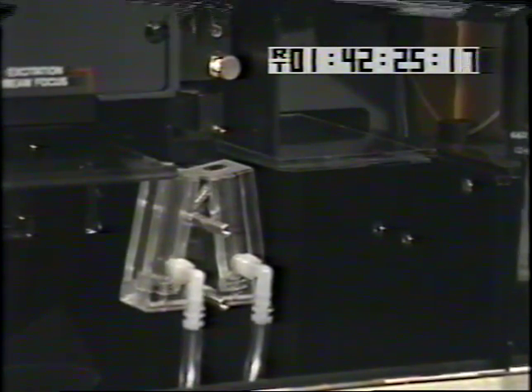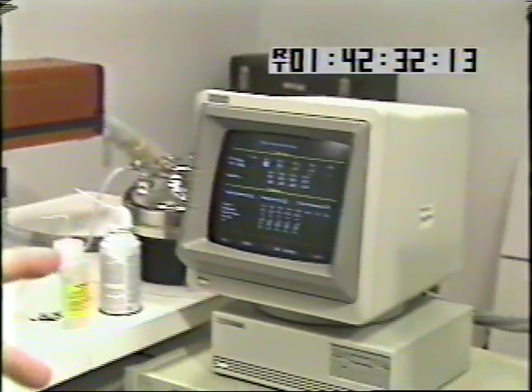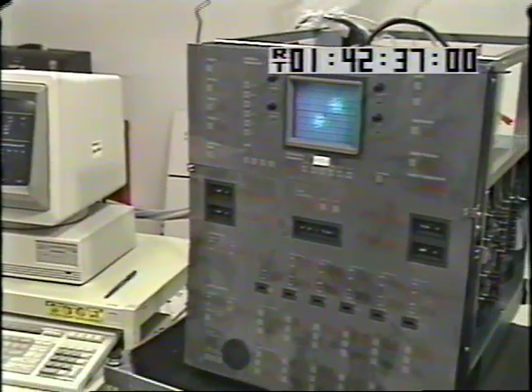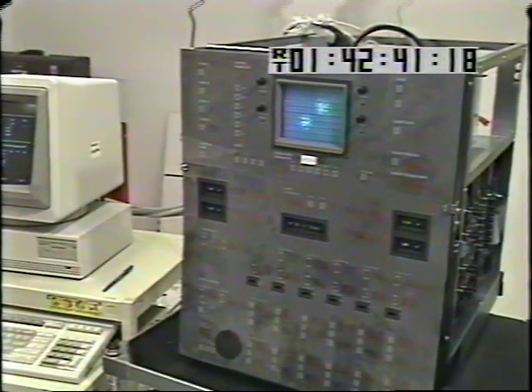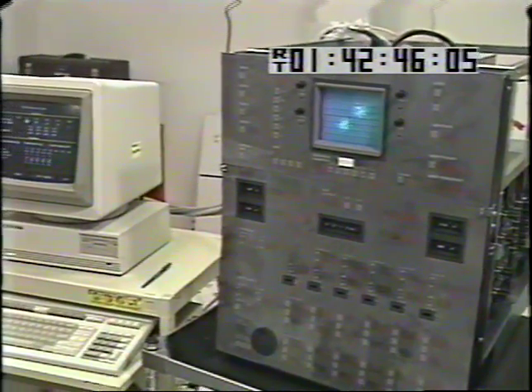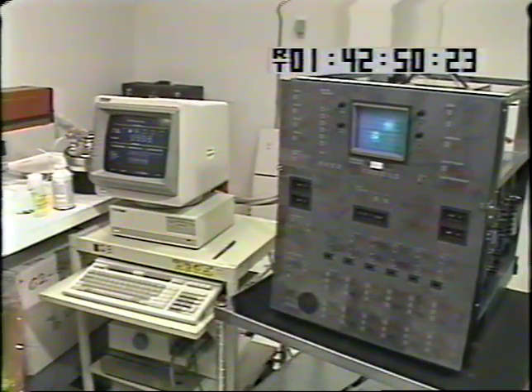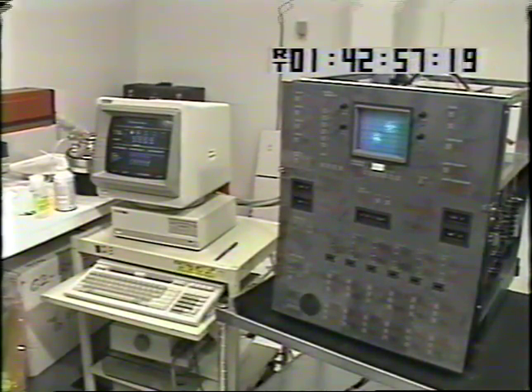The gating arrangement for the drive is controlled through the computer and electronic console modules, where we have the ability to set the gating parameters relevant to the flow of the droplets in the machine. This enables us to take the electronic signals given from the fluorescent housing system, which are characteristic of the fluorescence of the sample.